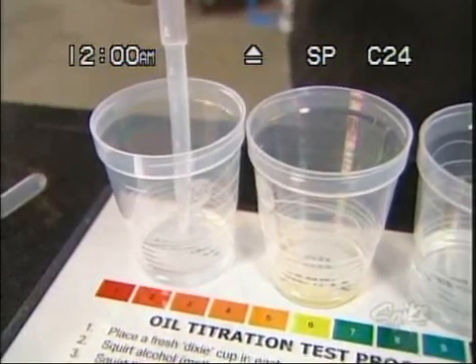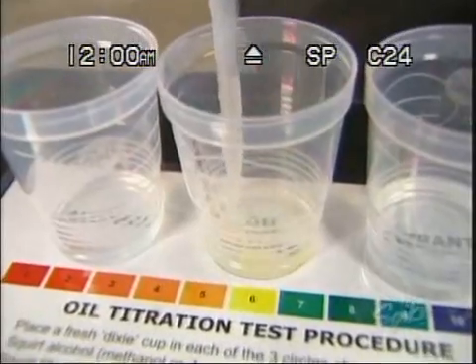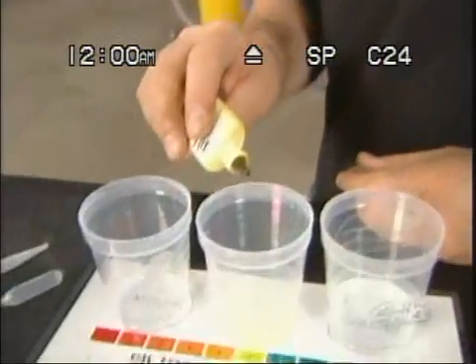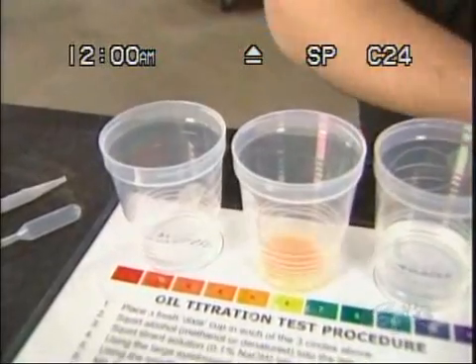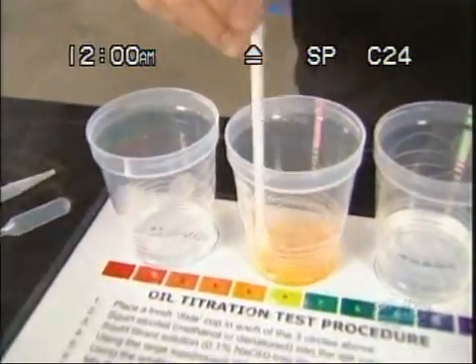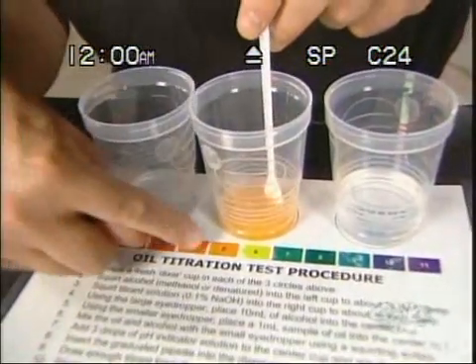We'll take the pH indicator solution that comes with the kit and add three drops and mix it together until it's kind of a milky white. Now, notice the color change here. According to the color chart, this is acidic.